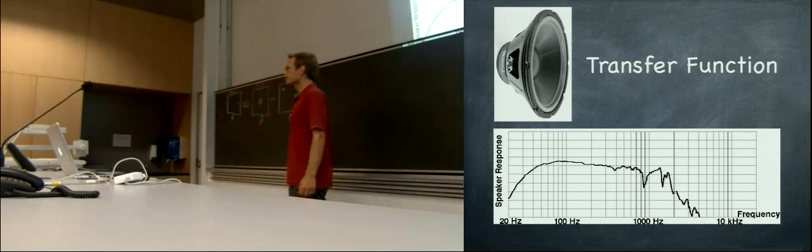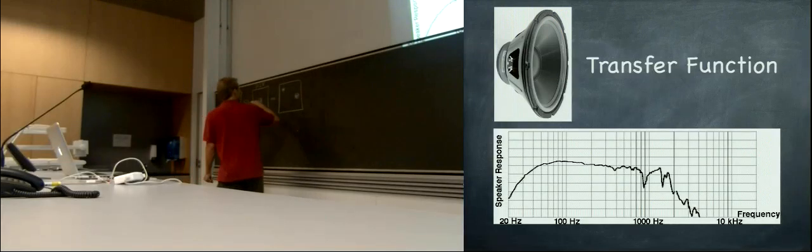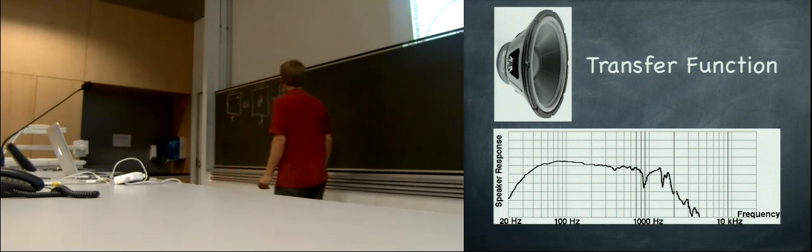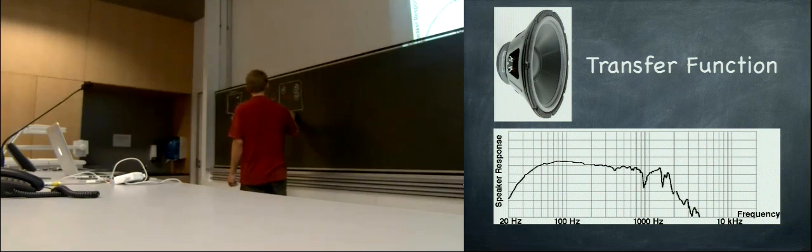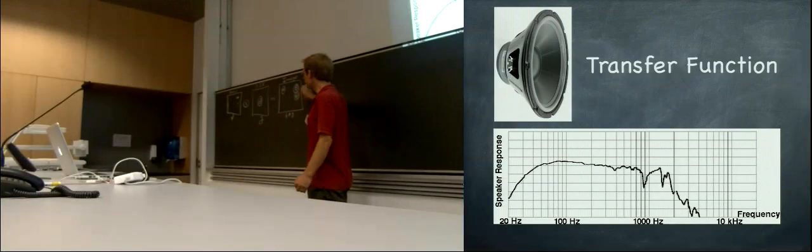Yeah? So, let's say we have three atoms. Another one is here, a stronger one, a bigger one. Then the convolution would produce another set of point spread functions, and they may actually overlap. So if they're a bit bigger, then they overlap. And this is our image. So this is F convoluted with G, and it's the image. And then you do all your image processing, and you get rid of the noise and so on.